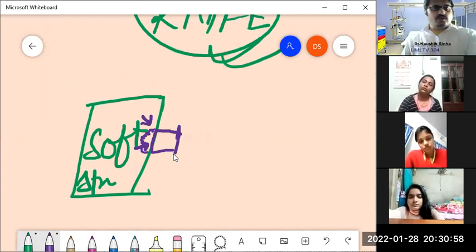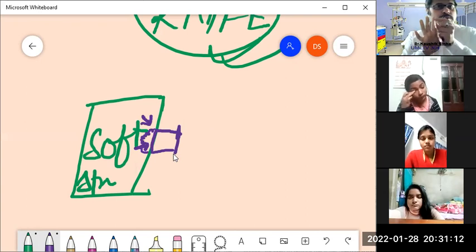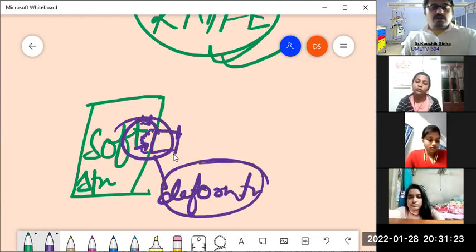right? To illustrate this, you can take your tip of finger and try to press with anything not very sharp, else you might cut your finger. But try to press anything in an attempt to cut this. Would you not find a small depression occurring at that area of press? There would be a small depression. So this localized deformation needs to be prevented again for that same purpose, that is preservation of the structure, minimization of the structural loss. Now, how do we do that?